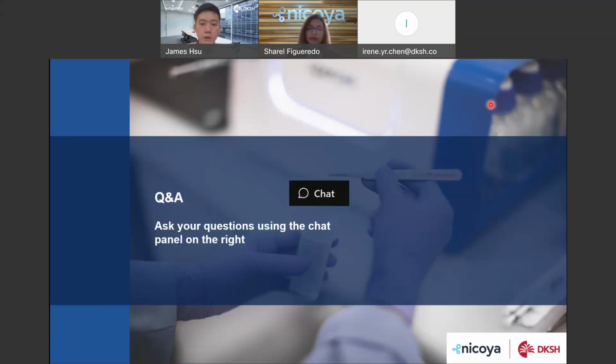Another question, what is the benefit of having kinetics on top of your KD value? I had mentioned that in my talk, which is that you get the on rates and the off rates. So the K on, or the rate of association, is how the therapeutic would bind onto, let's say, your ligand. So that's the time that's interacting.